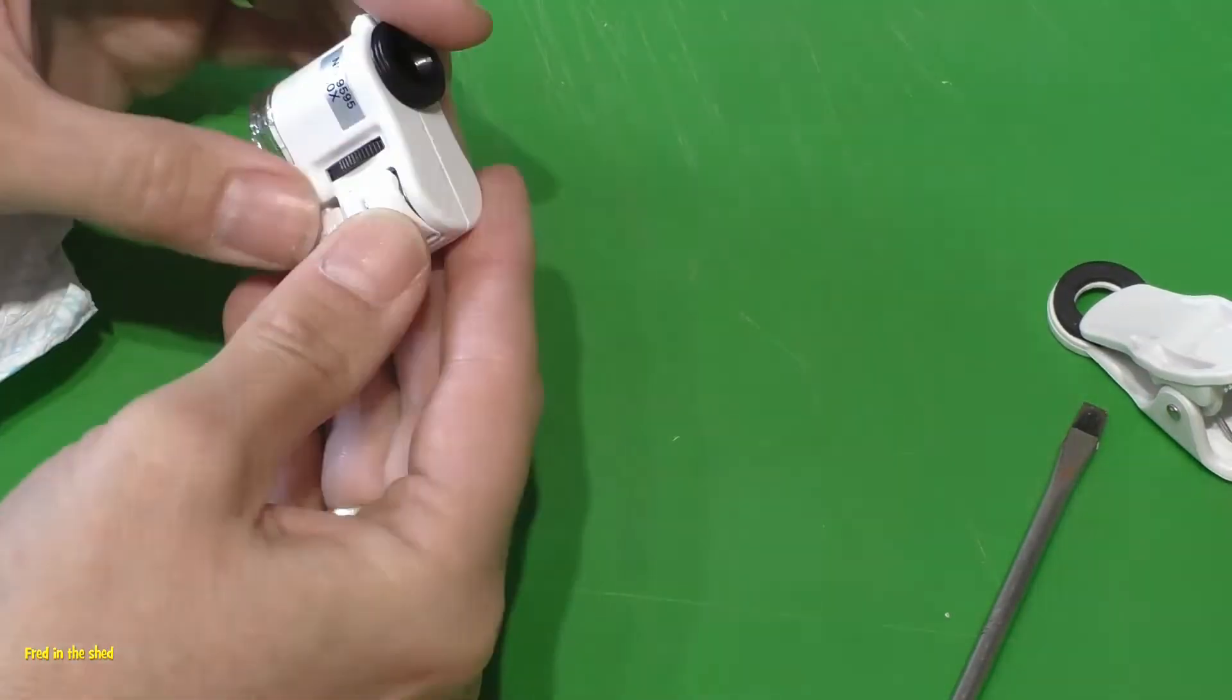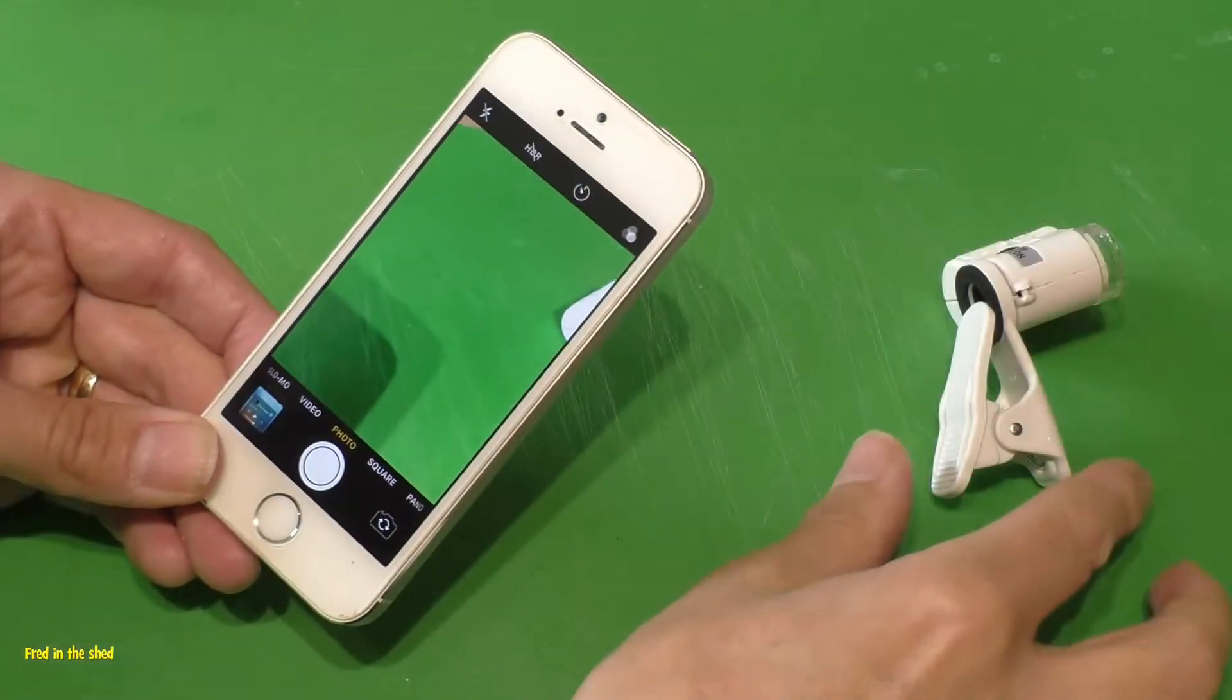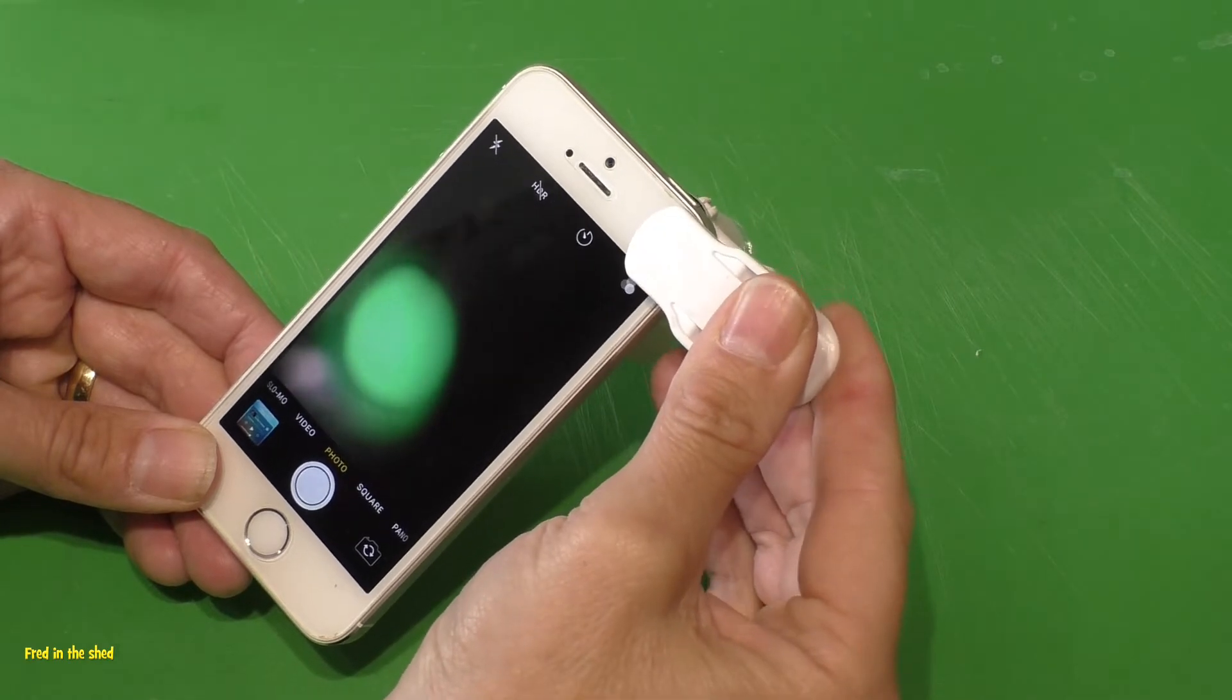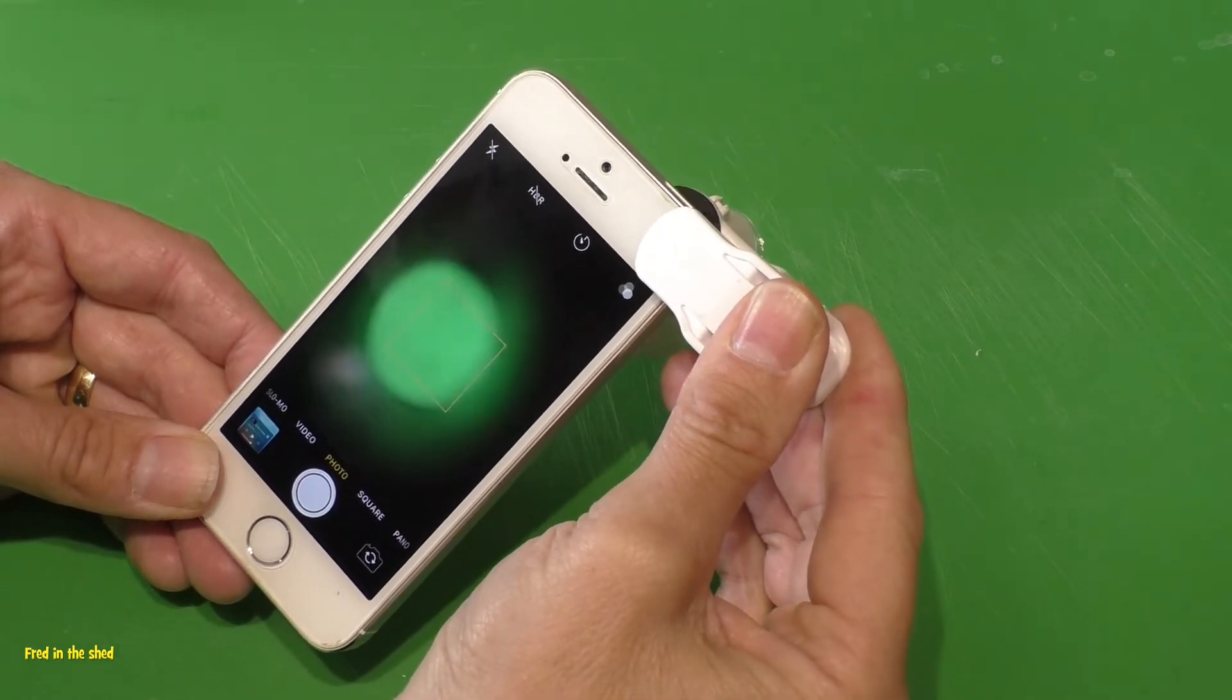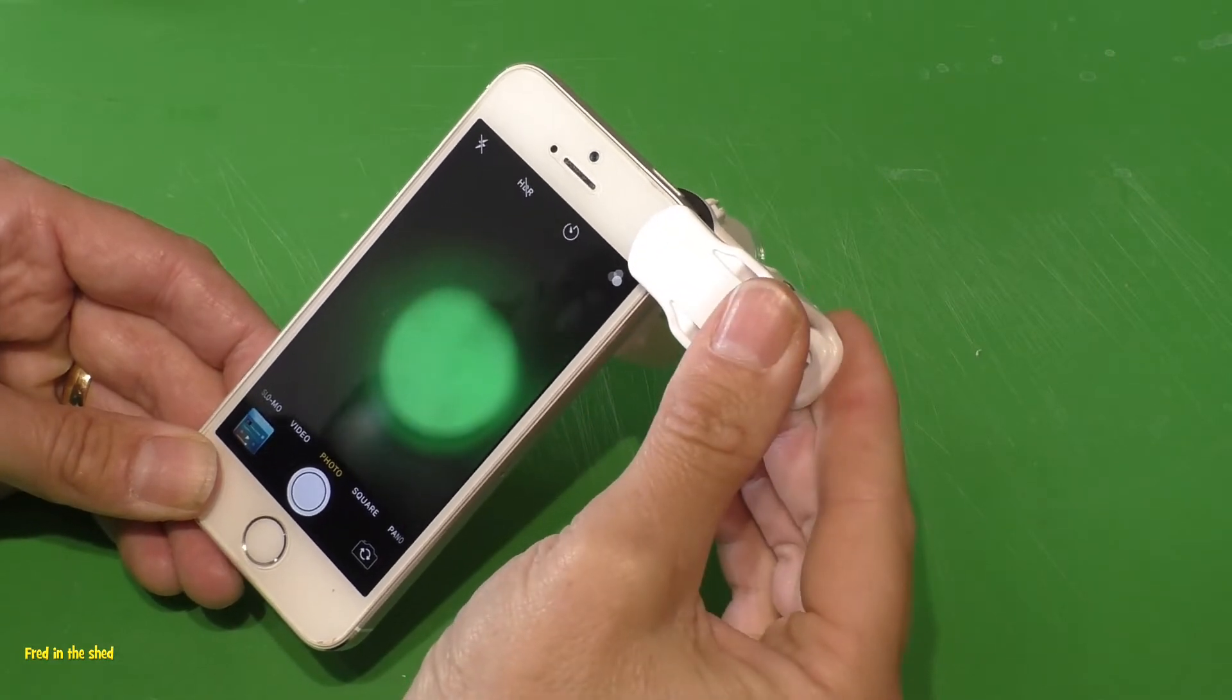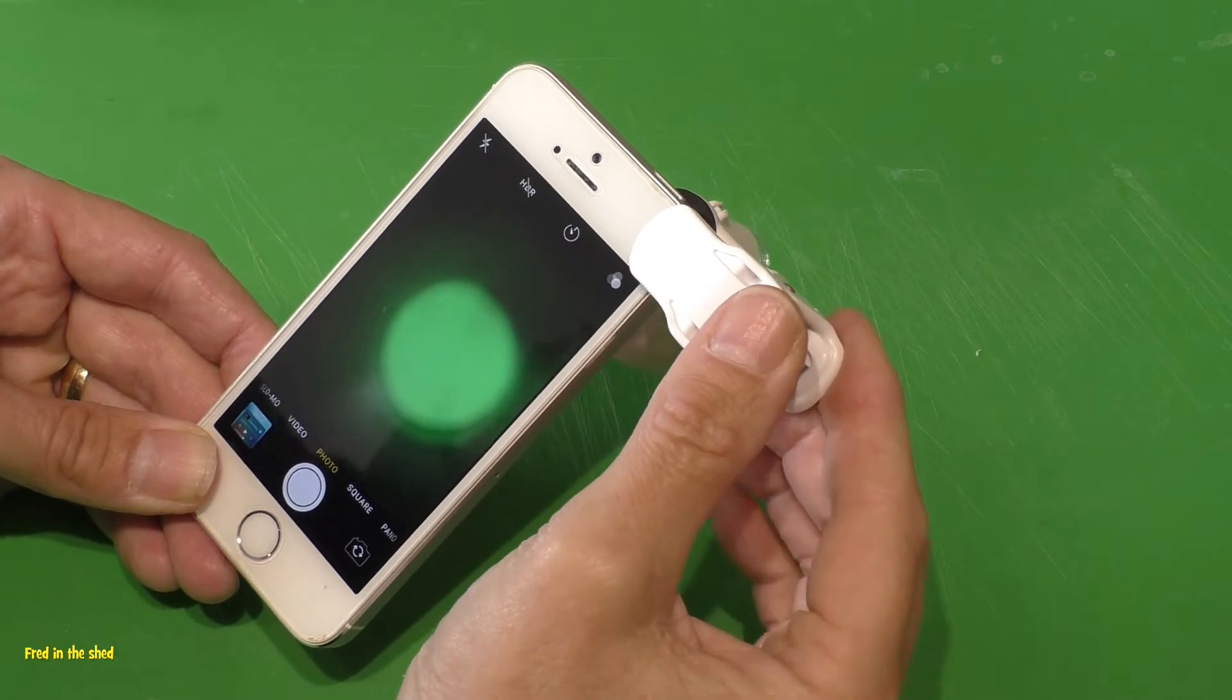How this microscope works is pretty easy, really. It just basically clips over the lens of your phone, and as long as your lens is towards the outer perimeter of your phone, it'll go on no problem. It's a little bit fiddly - you just have to centralize it, and once you get the lens in the middle, you can then use the zoom on the phone itself.